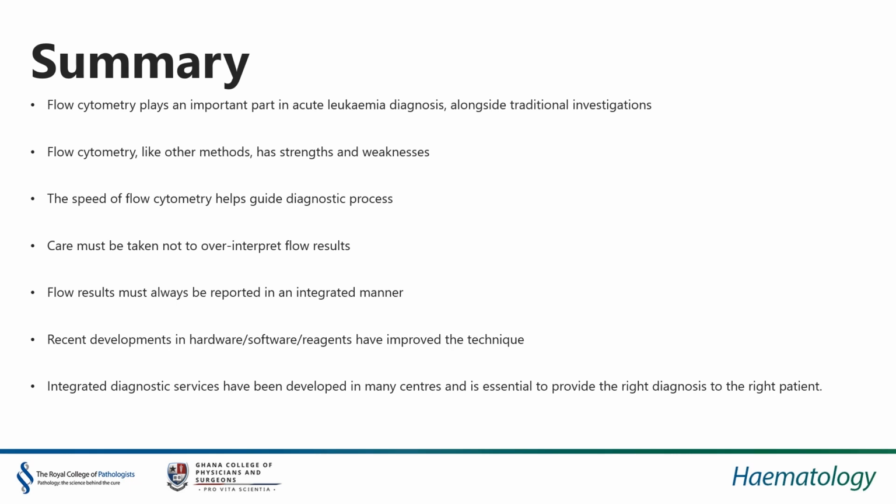And it must always be reported in an integrated manner with the morphology of the sample that you're performing flow cytometry on. Now, obviously, we are seeing a lot more development in the hardware and the technology, which has really helped improve the diagnostic technique. And integrated diagnostic services have been developed in many centres in many countries, which is essential in providing the right diagnosis to the right patient, ensuring they're getting the right therapy.